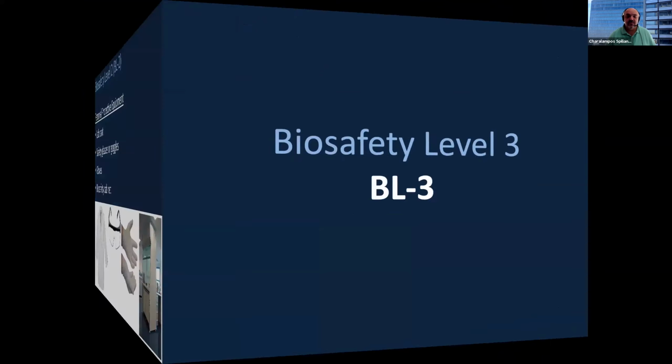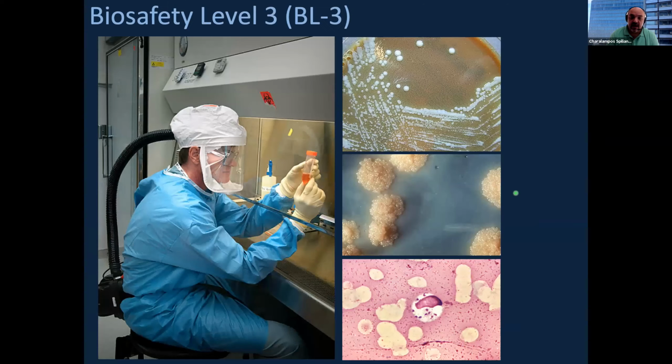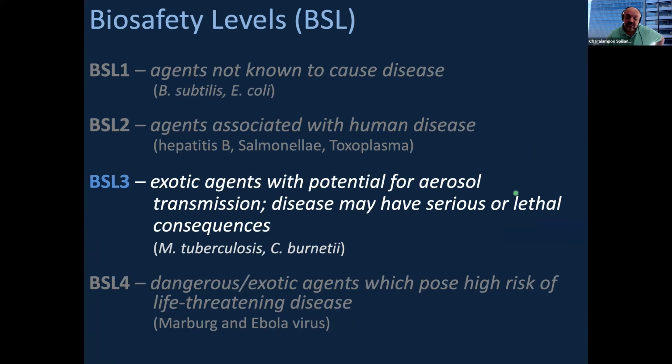Now, BL3 laboratories, we definitely do not have a BL3 designated research laboratory at the Imbb. I'm not aware if there are such laboratories over at the medical school, since they are potentially dealing with quite biohazardous microorganisms from human samples. So BL3 laboratories are designated for dealing with agents that are potentially airborne transmitted, and they could actually cause serious health problems. And here we are talking about microorganisms such as Mycobacterium tuberculosis or Coxiella burnetii.